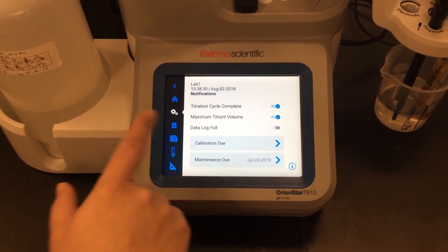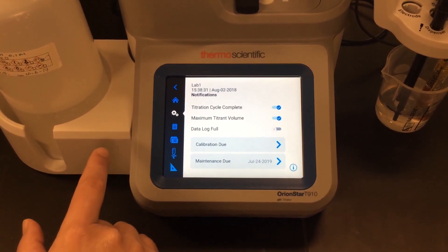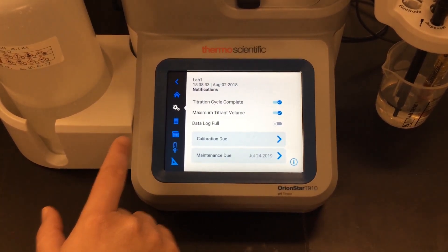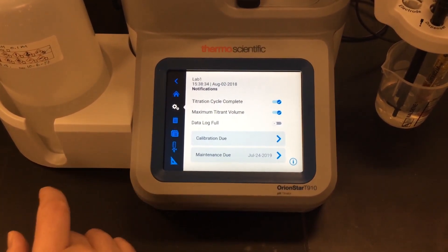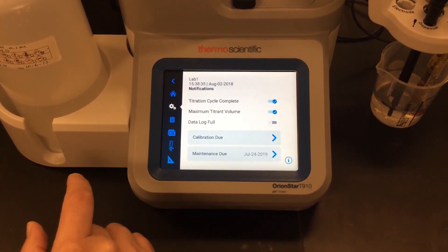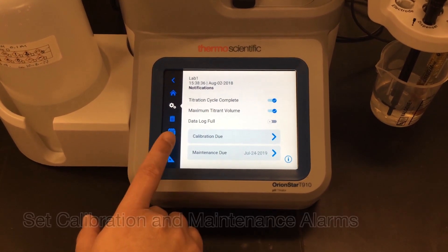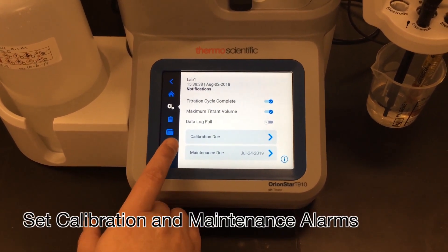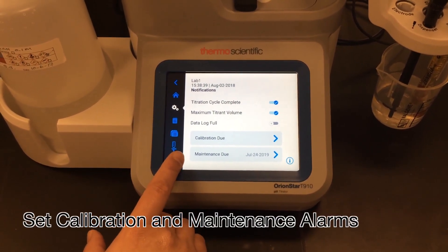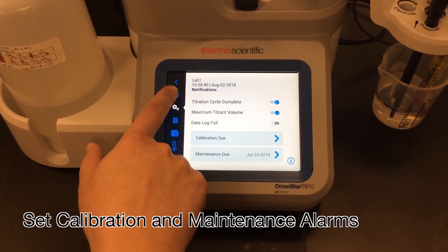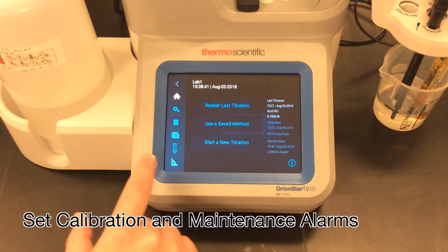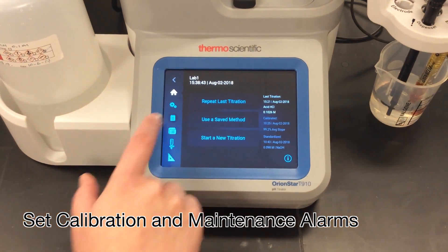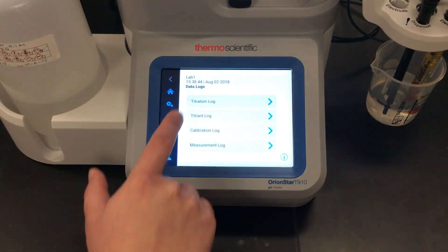I also have the option to set calibration alarms and maintenance alarms. I also get an alarm if my data log is full. The next thing I can go into is my data log.